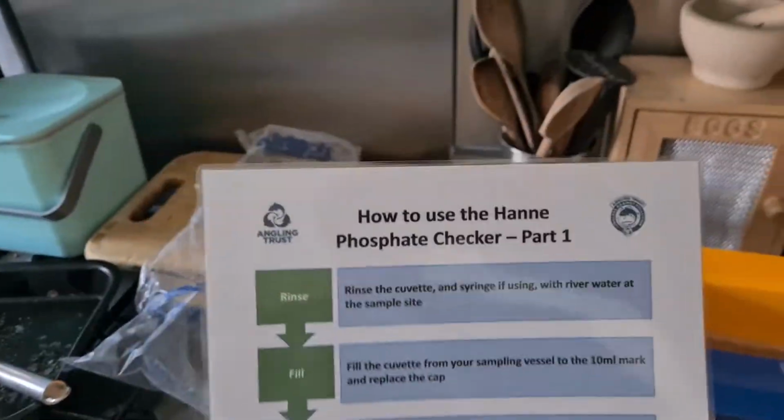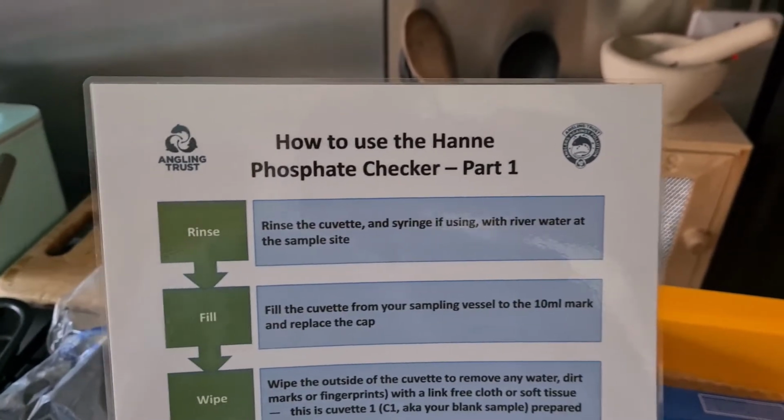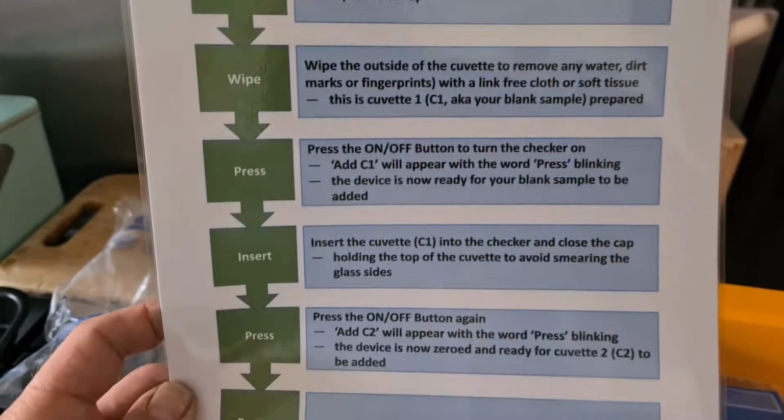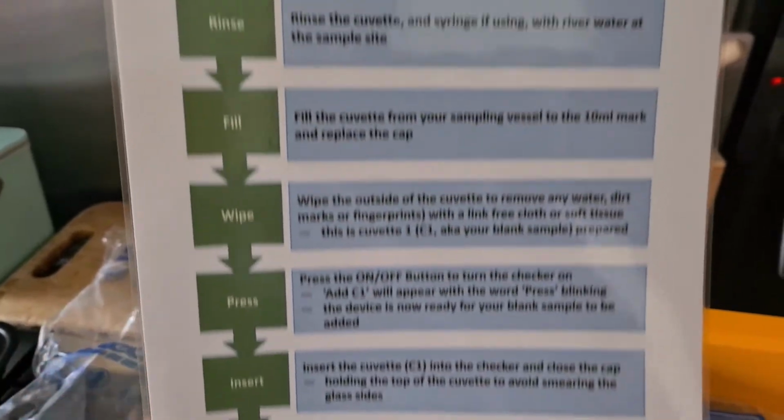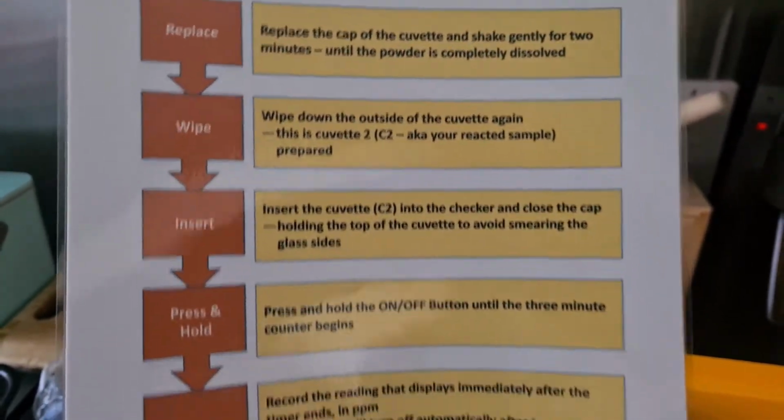Next one we've got is part of the HANA phosphate checker. Two parts to this, obviously. First part on one side, I'll flip it over. There's part two on the second side. Okay, we'll get to that bit of kit in a minute.